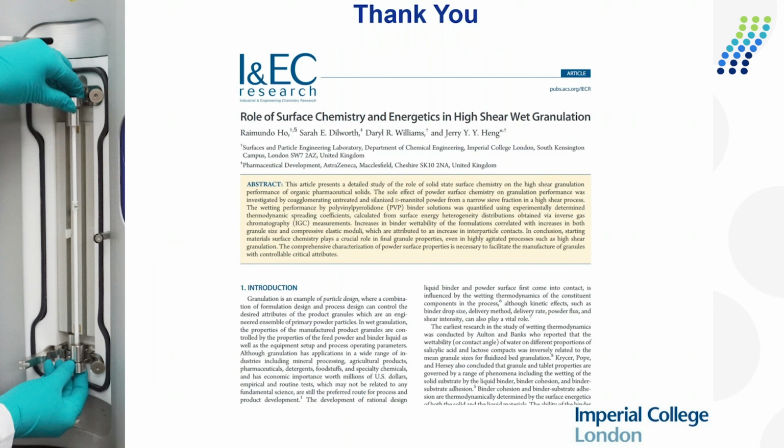Someone's asked around spray dried particles, how to make sure the organic vapor only passes through the surface and not through the internal voids and microstructure. It doesn't matter too much, to be quite honest. We're quite happy for the molecules to sample all the surface.